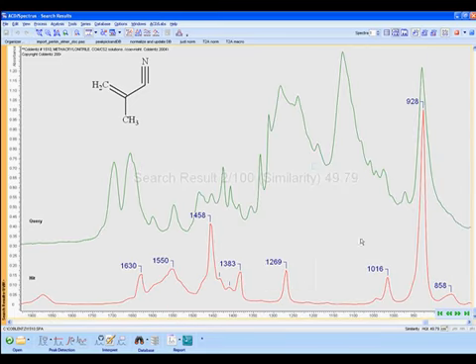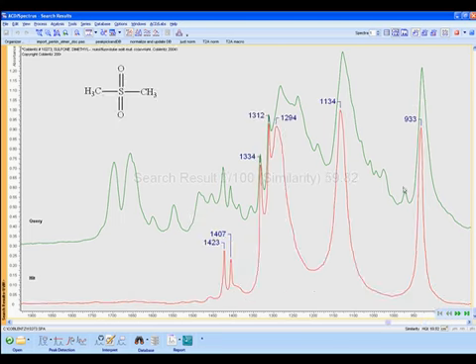Our current view will not change as we cycle through the matches. This will allow you to examine the same peak across different hits. To return to a full view, right-click and select Zoom All.